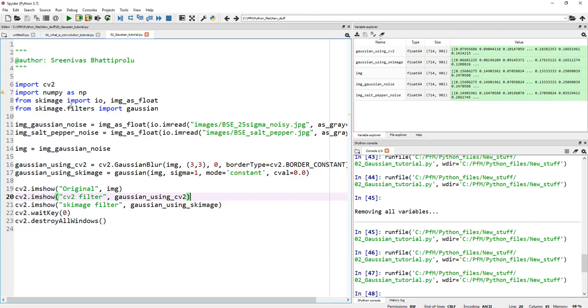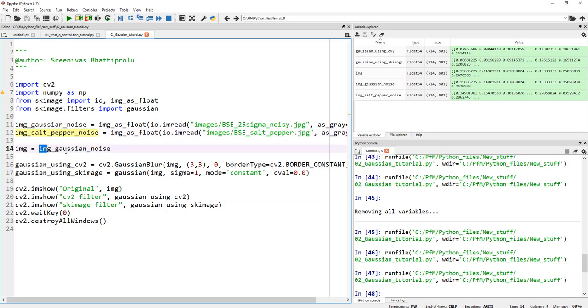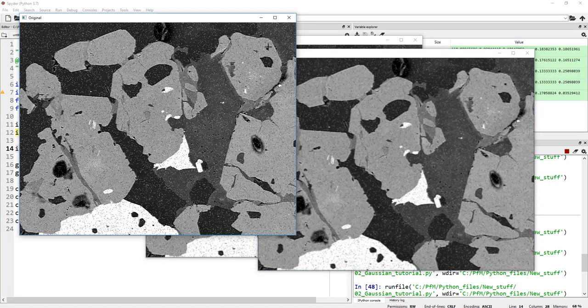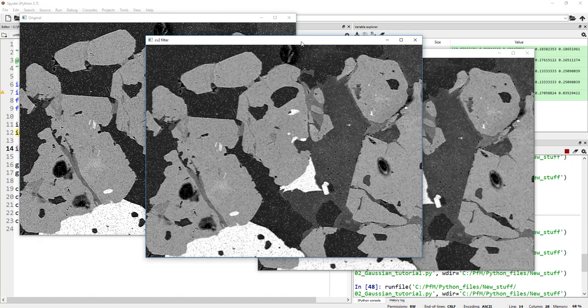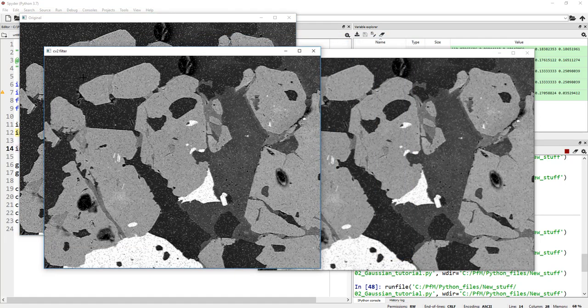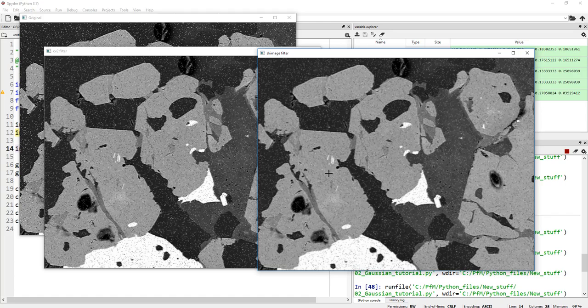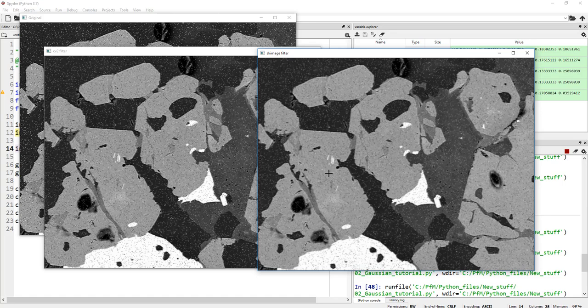How effective is it at cleaning salt and pepper noise? Instead of Gaussian noise image, let's apply this on salt and pepper noise image. Let's go ahead and run this one more time. You see how we have salt and pepper on the original image, and then the Gaussian image using CV2. You still see a lot of salt and pepper. You still see salt and pepper in the scikit image. While Gaussian filtering is effective at filtering out most of the random noise or normally distributed noise, it's not very effective at cleaning salt and pepper types of noise. That's why one noise denoising algorithm may not be enough for you.